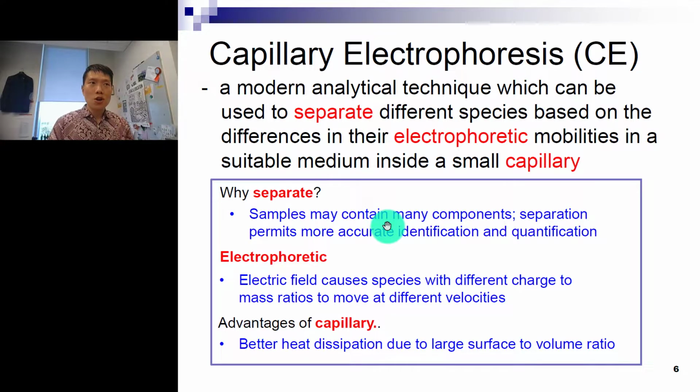For instance, you have your can of a soft drink, right? You want to see, oh, what are the sugars involved? Is it corn syrup? Is it starch? Is it glucose, fructose? They all taste sweet, but maybe our senses cannot detect the difference. So this is why we have this instrument. Also to know the amount, not just to qualify them for identification, but also quantification.